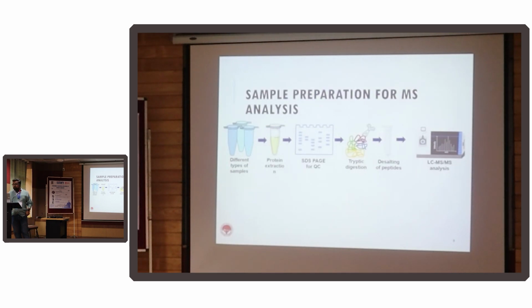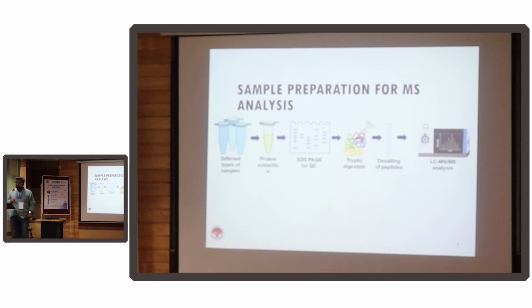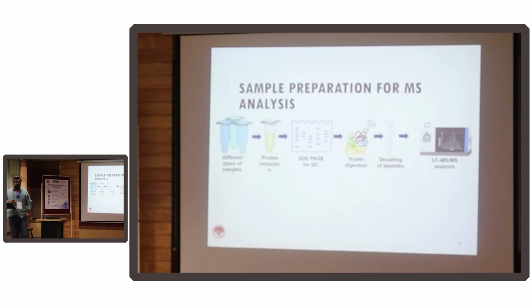And before we do that, we have to do an SDS-PAGE check for QC. I hope all of you understand what an SDS-PAGE is: sodium dodecyl sulfate polyacrylamide gel electrophoresis. It tells us about the sample integrity.